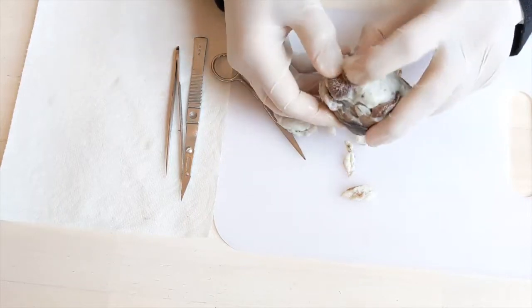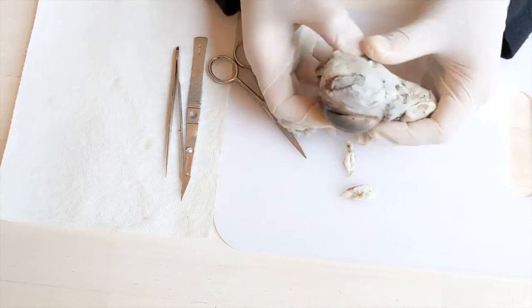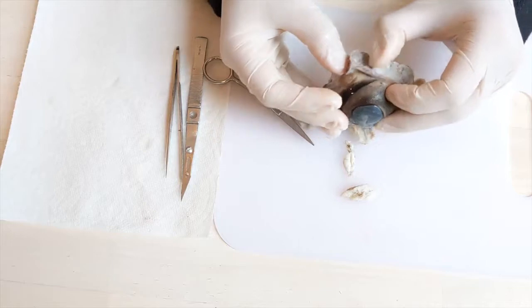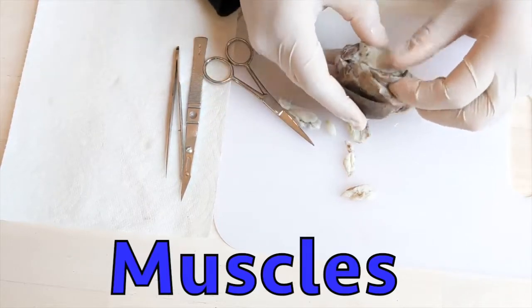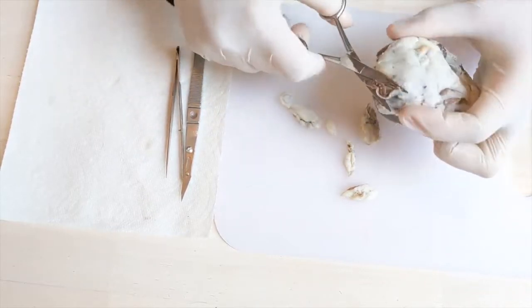I want you also to notice that there is some brown stuff here. Do you see that? Can you guess what this is? What do you think it is? I think it's muscles. Oh, you're right, exactly. Yes, there are muscles.